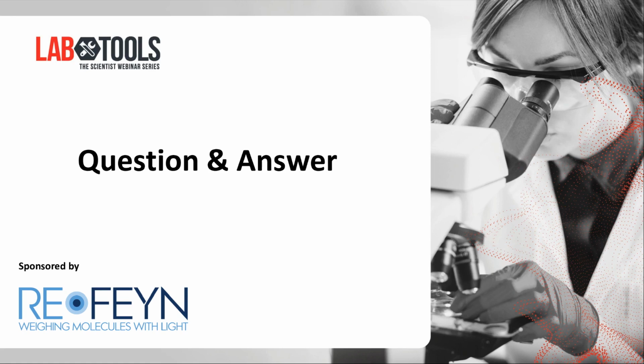Thank you. Is it possible to measure or look at drug interactions with your membrane proteins using this system? I guess so. Drugs are normally quite small, so visualizing the drug itself would be, I guess, hard. But if your drug, for example, induces oligomerization, you should definitely see the oligomerization that is being induced.